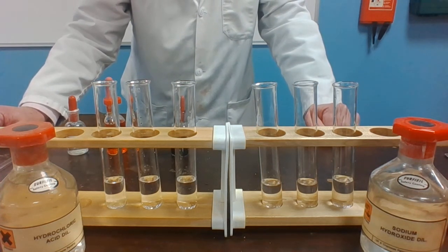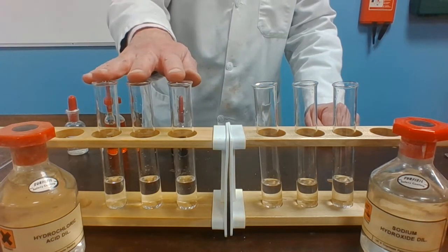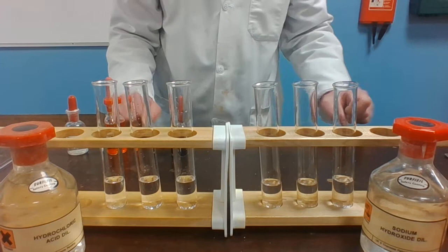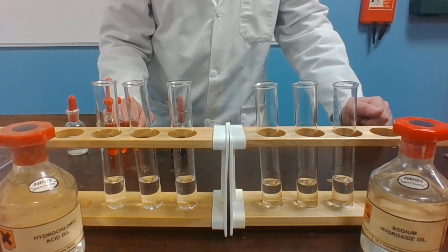In this video clip we're going to look at the colors of three indicators in acid and alkali. These three boiling tubes contain hydrochloric acid, and these three boiling tubes contain sodium hydroxide, which is an alkali.